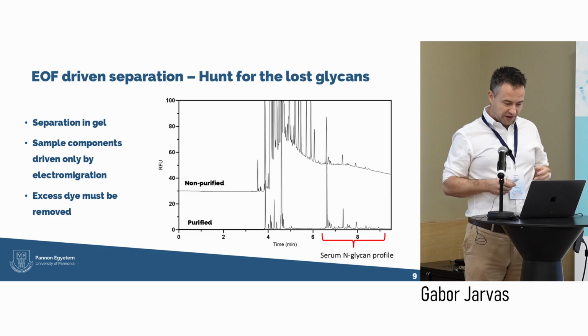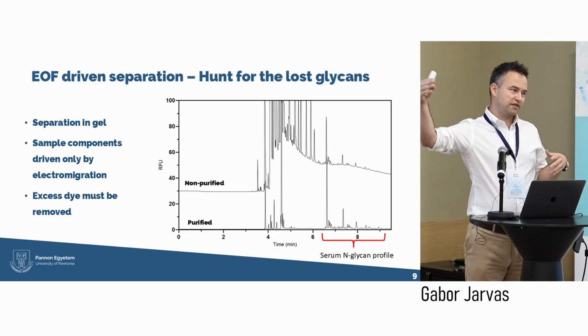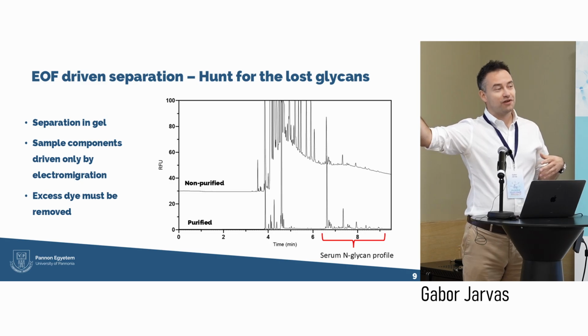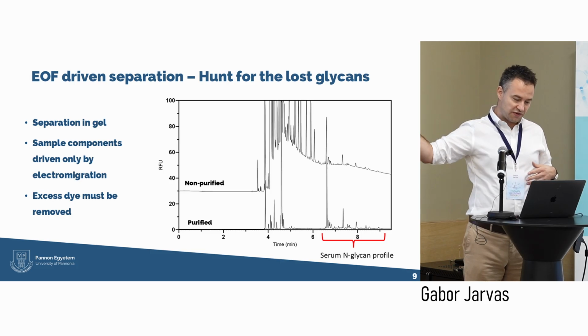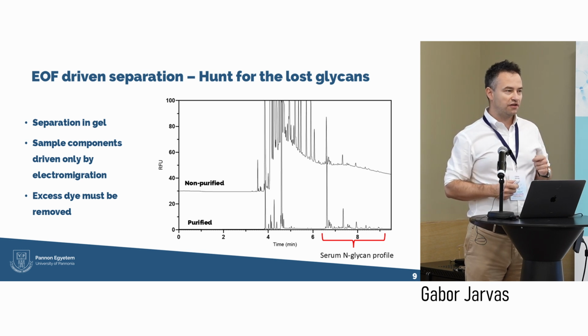So then we got to the decision point where we finished the further evaluation of the traditional CE-based glycan structure identification, and we took a huge step and started to develop a new method where there is no need for excess dye removal.